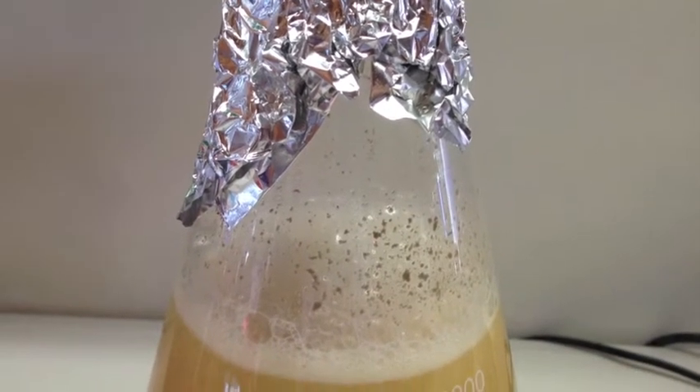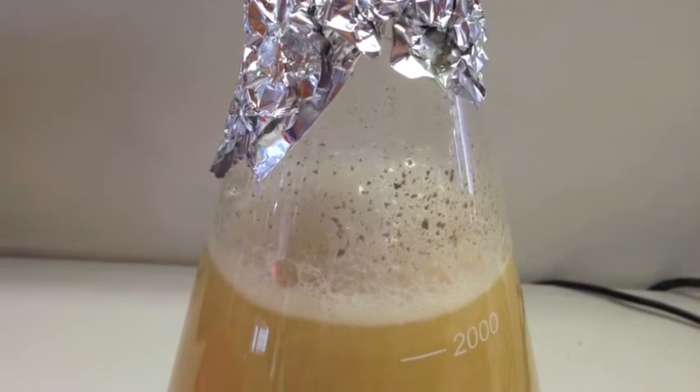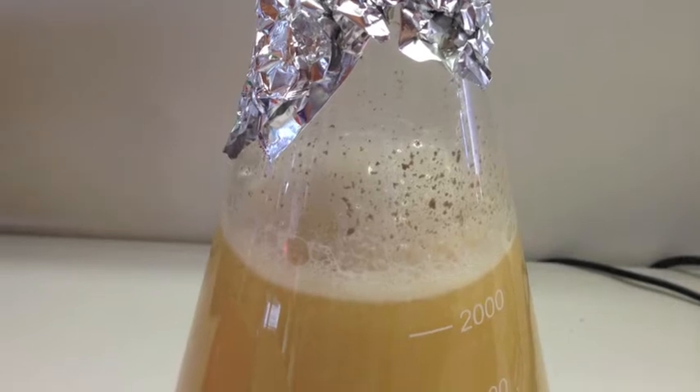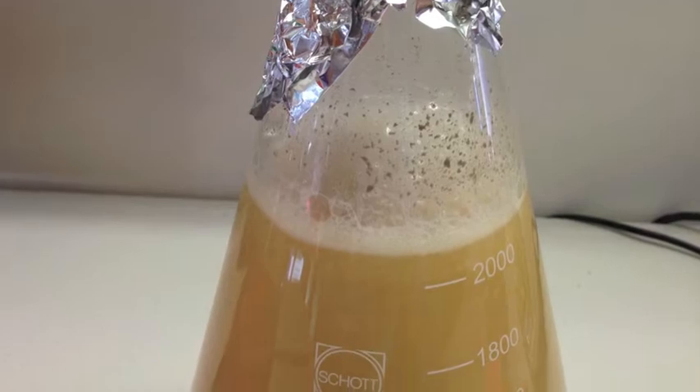Changing your pitching rate is something that can also affect your beer and make your batches less consistent. So growing your starters under more controlled conditions should help iron out some of these variables, and that's where the digital stir plate really shines.